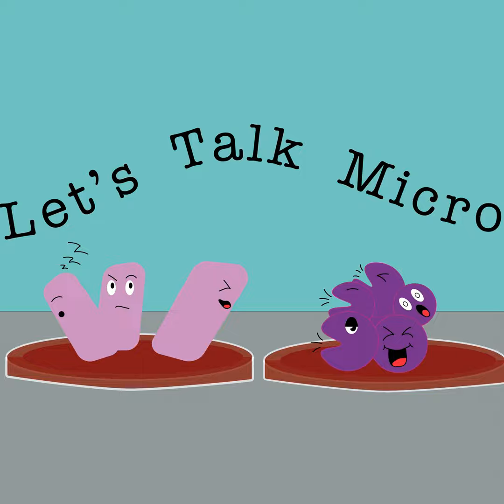But with these tests I have covered, you basically have no trouble IDing staph versus strep. So today we covered Optochin, which you use for Streptococcus pneumoniae, and then we covered the Microdase disc, which you use for Micrococcus species. And with this, we wrap up the gram-positive cocci, and then we move on to the gram-negative rods, which have different biochemicals.